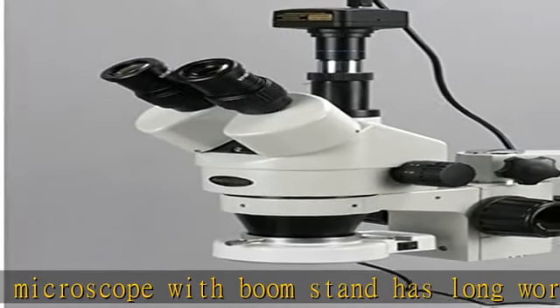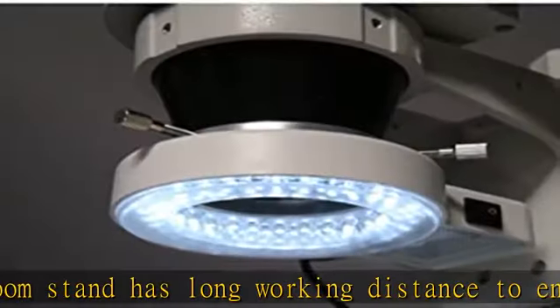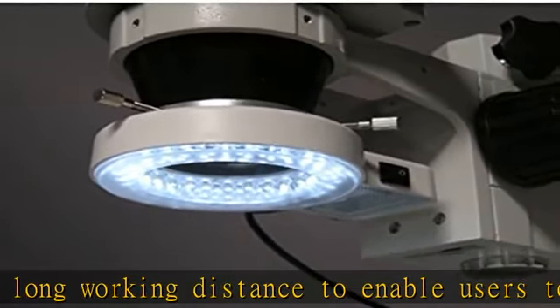It has a 5MP camera with reduction lens and USB 2.0 output for capturing or displaying images on a computer or projector.